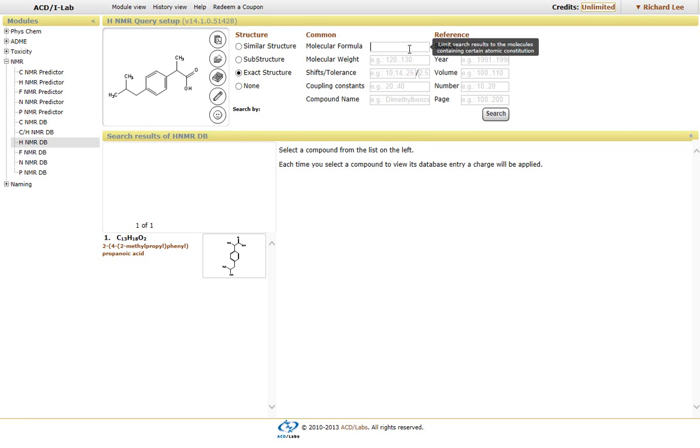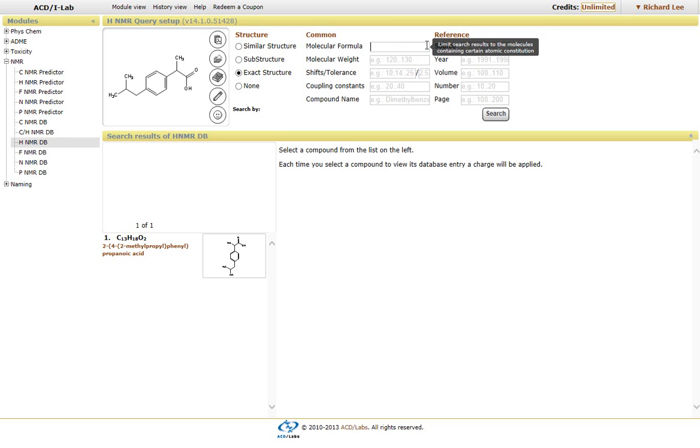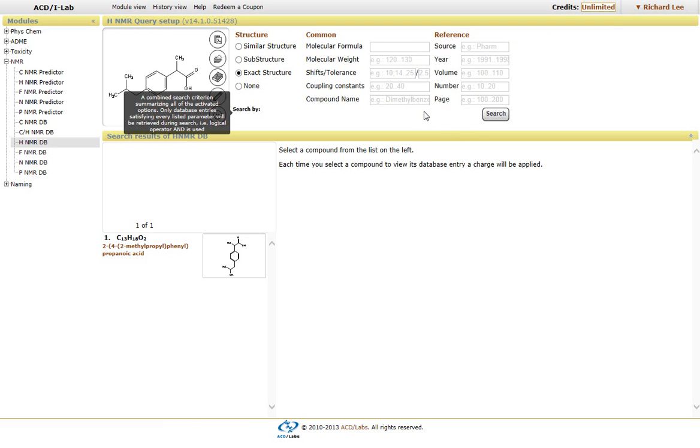In this case, if you put in C bracket 1 through 10, it will look for compounds that will have up to 10 carbons within the molecule itself. We have the ability to restrict the molecular weight, shift tolerance, coupling constants, as well as if you want to look for the name itself.